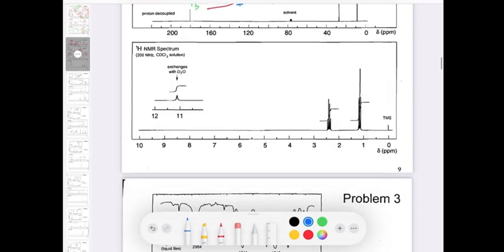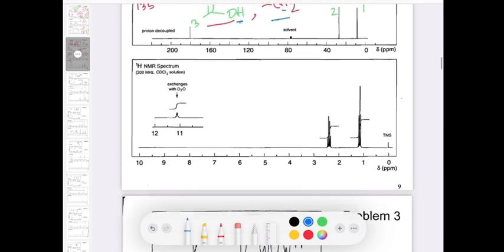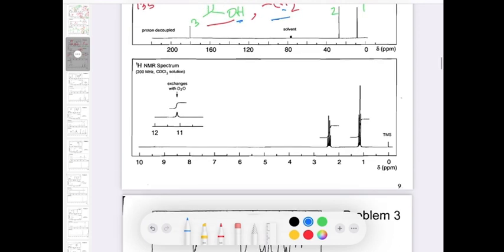Now if I see on the proton NMR, then you will see a triplet. And if you see here the integration value and here the integration value, clearly you can say if it is 3, then it will be 2, the ratio, a little bit less, right? So definitely that means there are two hydrogens and it is a quartet.